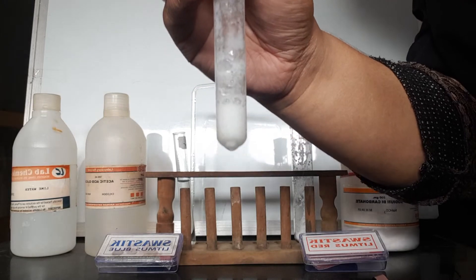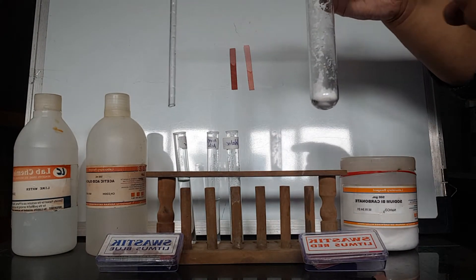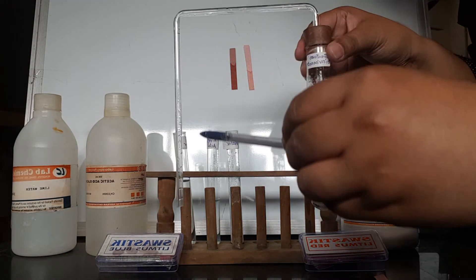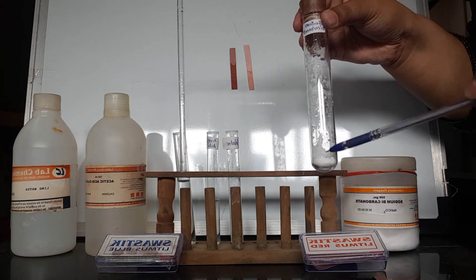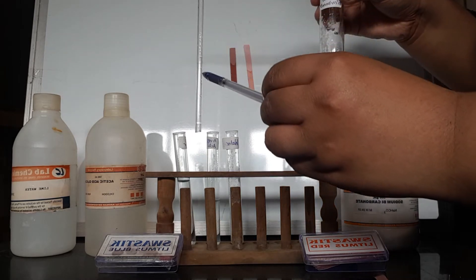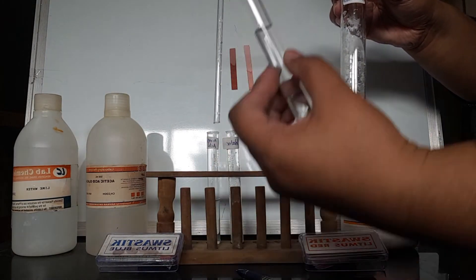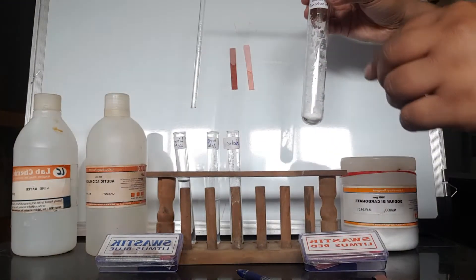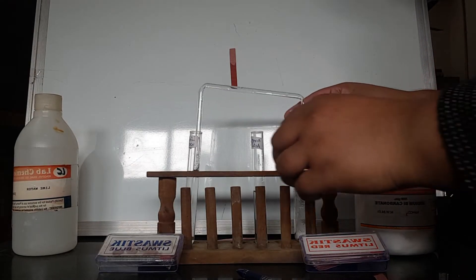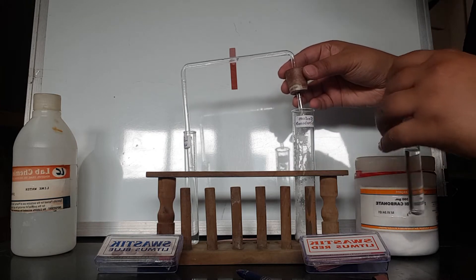To find out which gas is released, we perform a lime water test. We take sodium bicarbonate in a large test tube, fit a rubber cork and a bent delivery tube, and add 4 to 5 ml of acetic acid. The gas coming out from the delivery tube is passed through freshly prepared lime water.